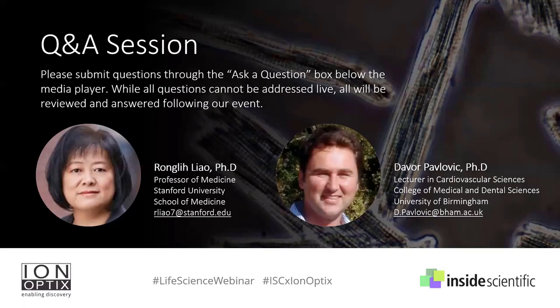Great question. If this happened, it is actually a sign telling you that the myocytes you isolated are overdigested, and they already have some membrane damage. So when the calcium is added, you will immediately see them going into contracture or balling up. So I think you have to go back and reduce the time of your digestion or reduce the enzyme concentration slightly.